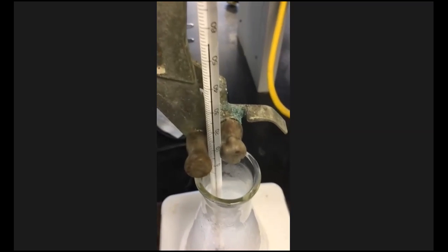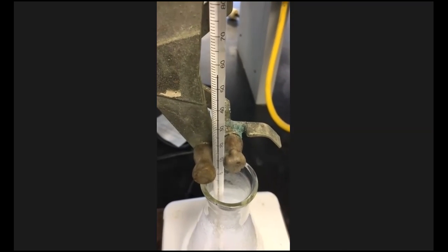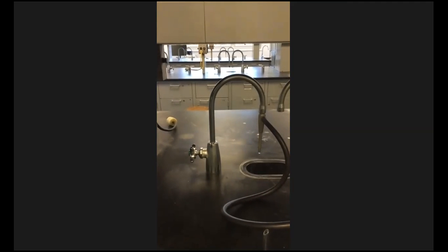All right, so right now you can see the temperature, get at an angle so you can see the mercury. It's at about 57 degrees. Can y'all see the mercury in there? Yes. So it's at about 57 degrees. So that's good. I actually turned off the hot plate because we only got a minute left and I don't want any mishaps. We're just gonna keep it on the hot plate because the hot plate is still warm. We're gonna keep it there and let it finish.